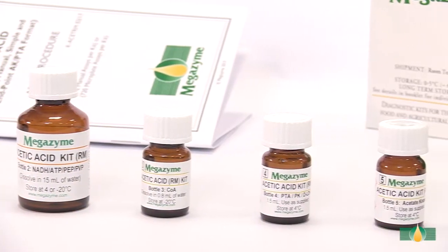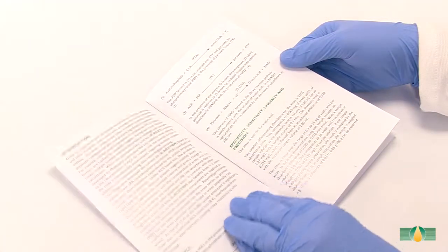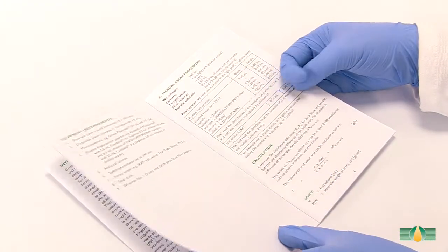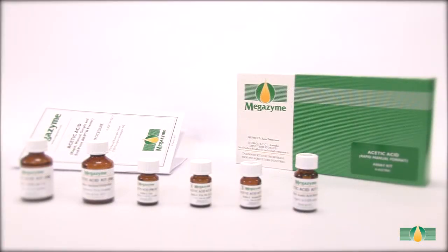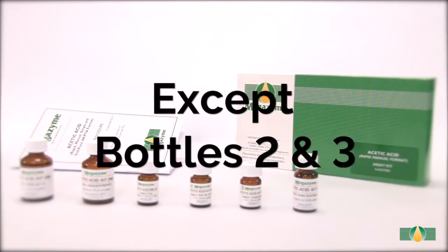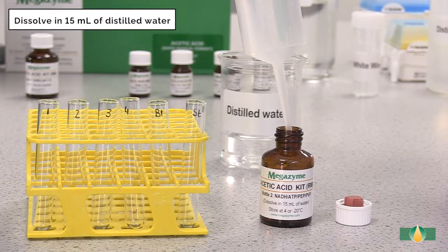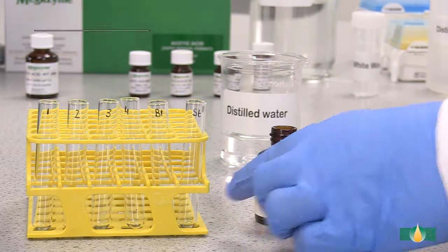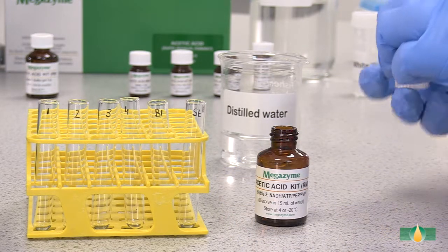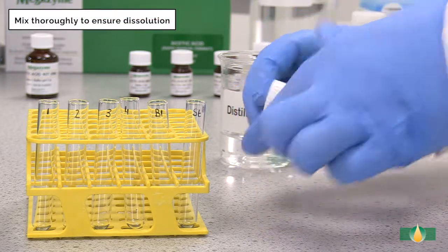Prior to sample analysis, the kit components should be prepared as described in the kit data booklet, and once prepared, they are ready for use in the manual assay procedure. All of the kit components except bottles 2 and 3 are used as supplied. The contents of bottle 2 are dissolved in 15 milliliters of distilled water. The bottle is capped and the contents are mixed thoroughly to ensure complete dissolution.